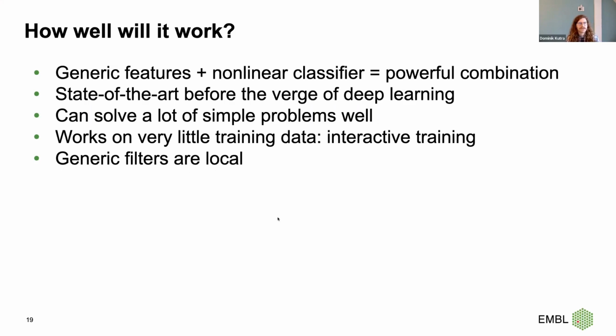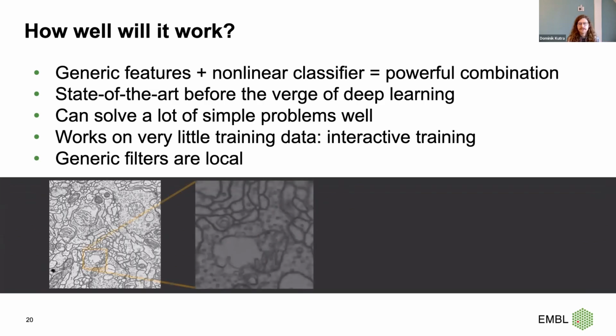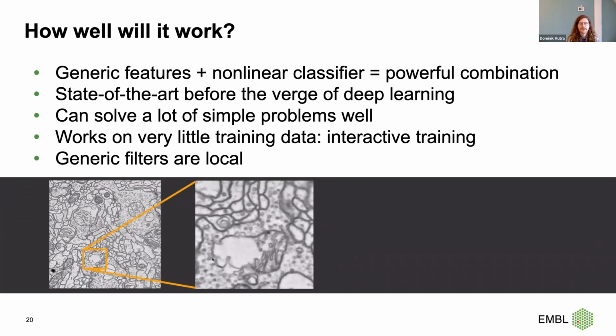What I mean by this is, if we look again at this EM volume, or one slice of it, and if we zoom into this volume, you have to take my word for it, I also only know this because people have told me, but this is the mitochondrion here. And you can see this because it has some squiggly stuff here. So as a human, if you zoom in like this, you can see clearly this is the mitochondrion, easy.